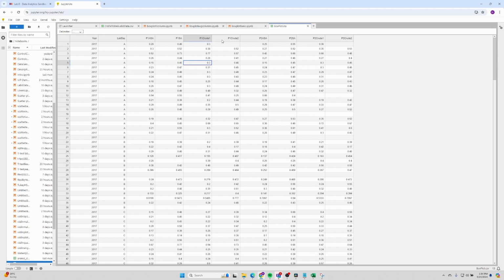And it actually has two spots. One spot, the lower spot, corresponds to the product that we want right here. This upper spot is starting material. So this is an impurity, because we want 100% this, but as you'll see, we're not getting it. And the second spot here corresponds to that. So we do chromatography, it's able to split up the chemicals into two separate spots, and we're able to visualize that using a TLC plate.